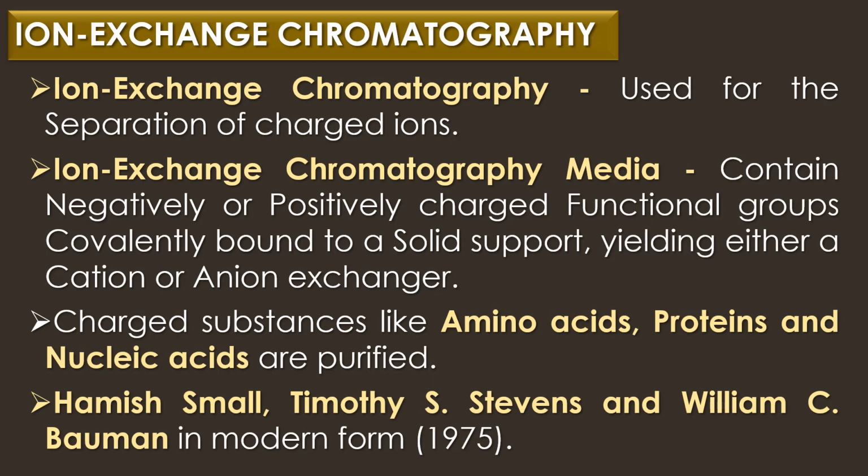Ion exchange chromatography. Ion exchange chromatography is a type of chromatographic technique used for the separation of charged ions. Ion exchange chromatography media contains negatively or positively charged functional groups which are covalently bound to a solid support, yielding either a cation or anion exchanger respectively.